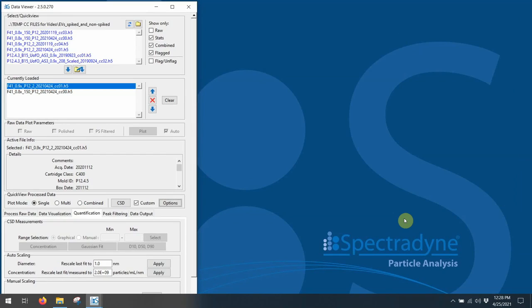Now, let's move on to the in-measurement verification. Again, this is a unique capability of the NCS1 and not possible with other systems, especially those using light scattering techniques. So first, I'm going to load in a measurement of an extracellular vesicle sample right here.